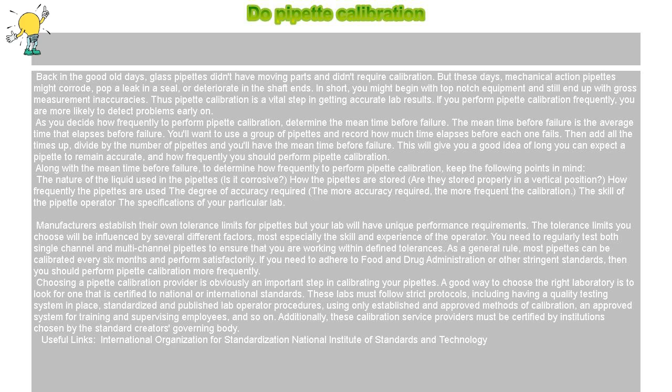As a general rule, most pipettes can be calibrated every 6 months and perform satisfactorily. If you need to adhere to Food and Drug Administration or other stringent standards, then you should perform pipette calibration more frequently.